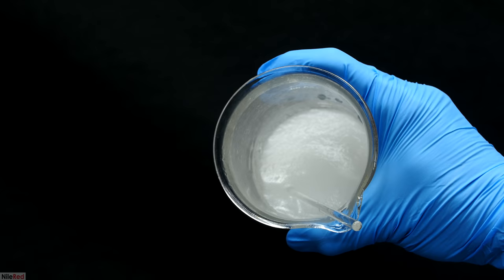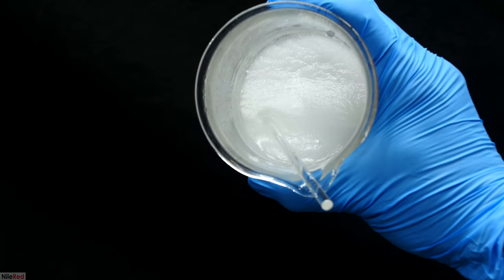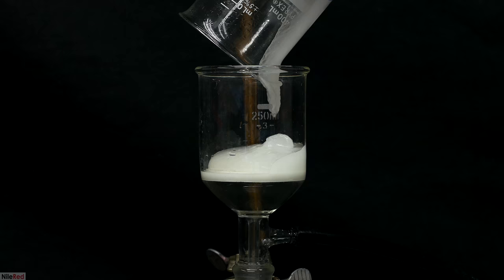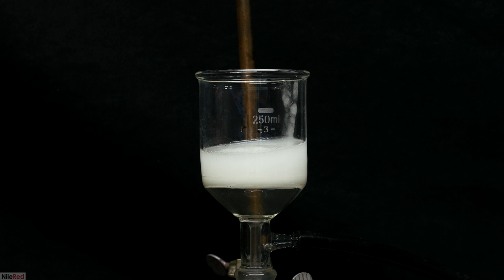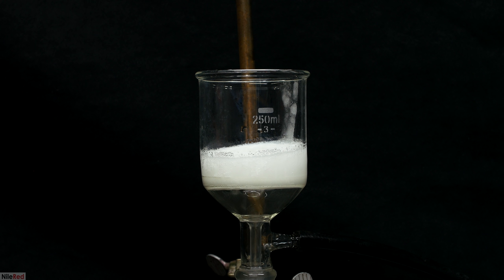In the morning, I was left with this nice viscous goop, which I then moved on to filtering. I poured out as much as I could into the filter, and I scraped out the rest using a glass stir rod. I turned on the vacuum and started to pull out the water. The goal here is to pull out the majority of the water, but it's going to be nearly impossible to pull out all of it.